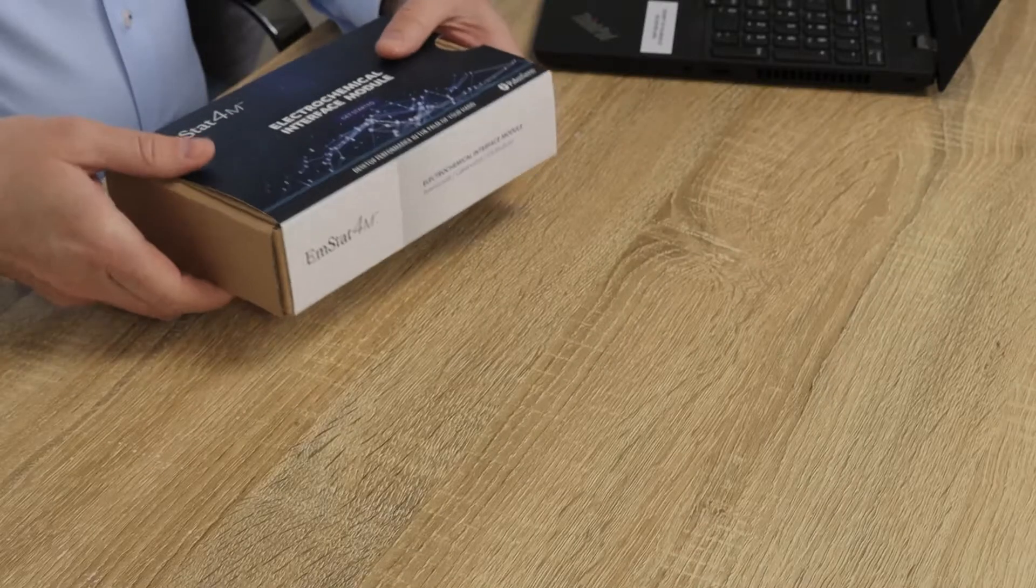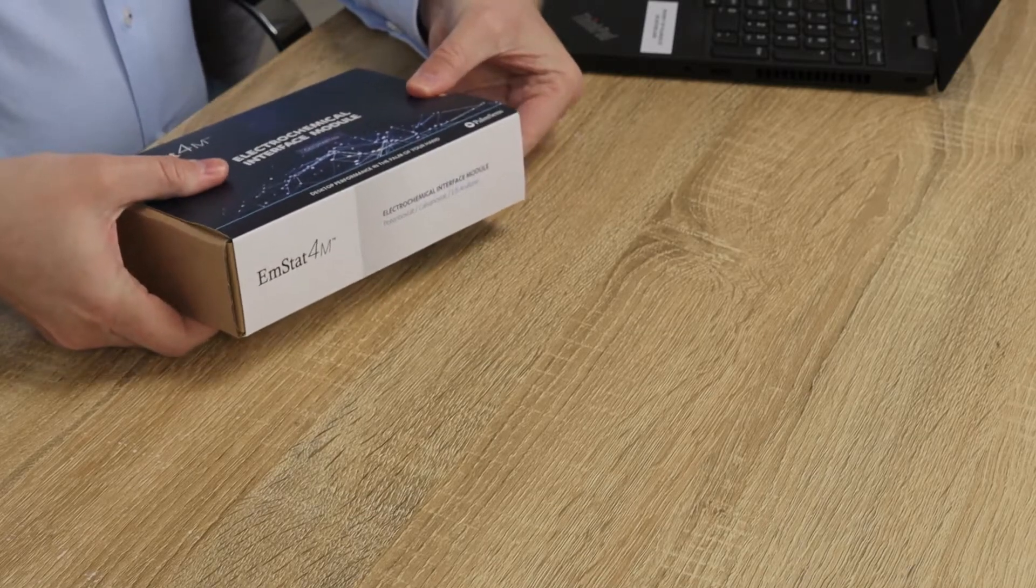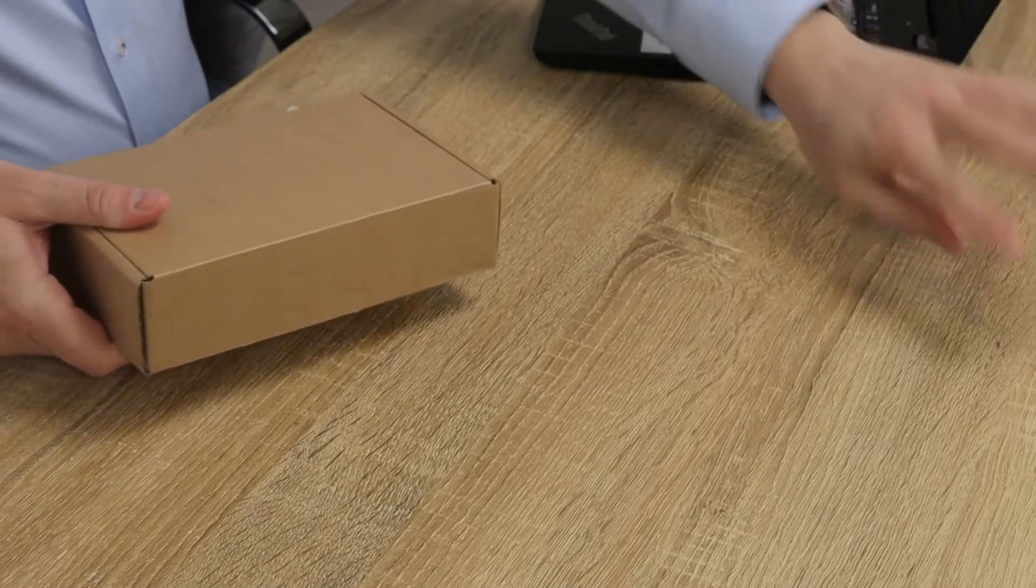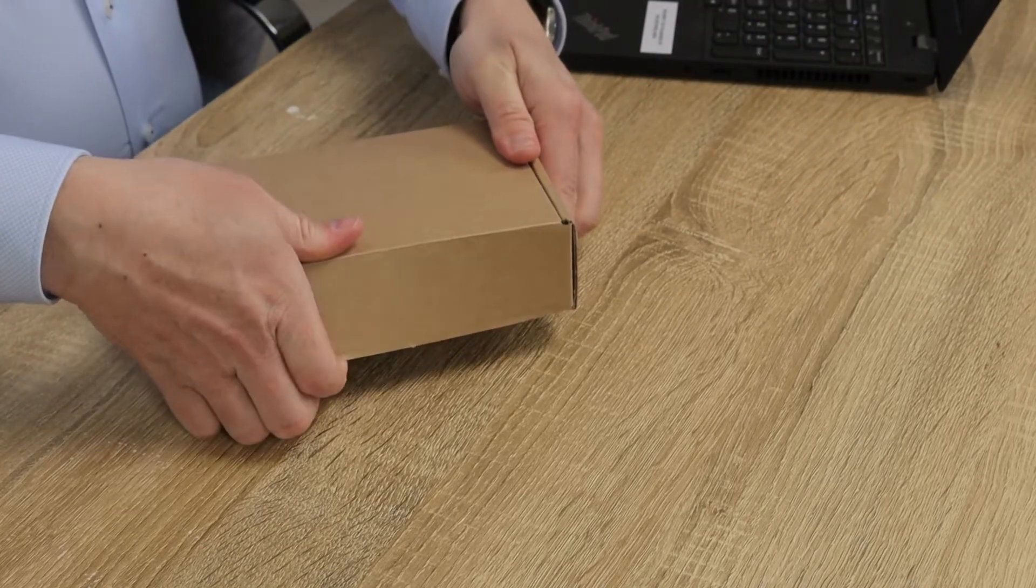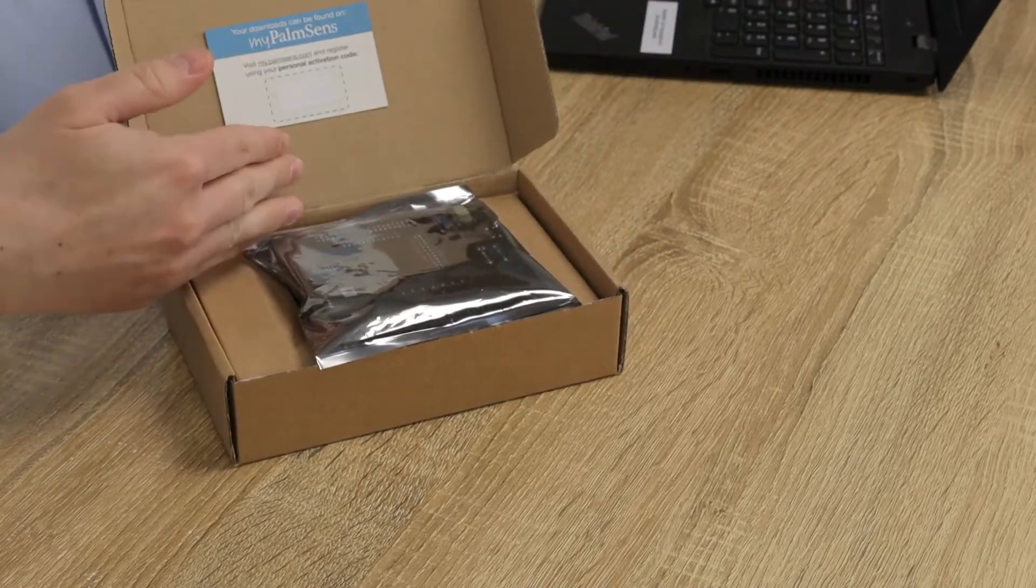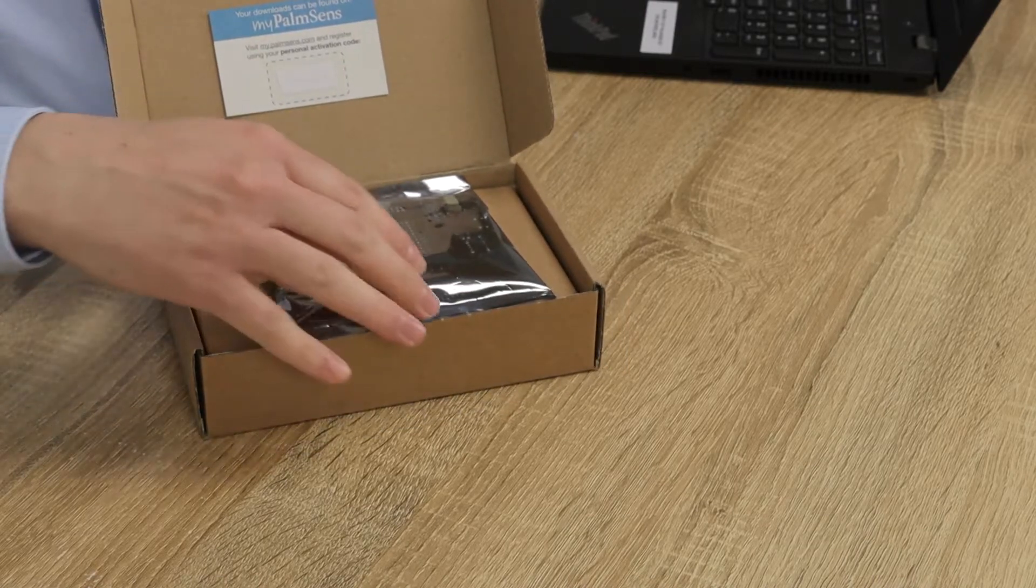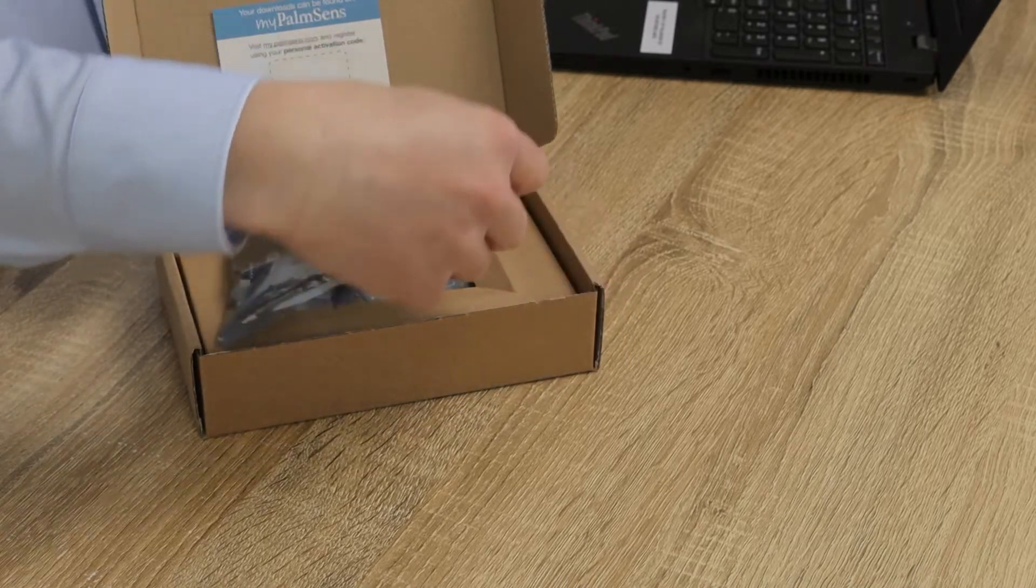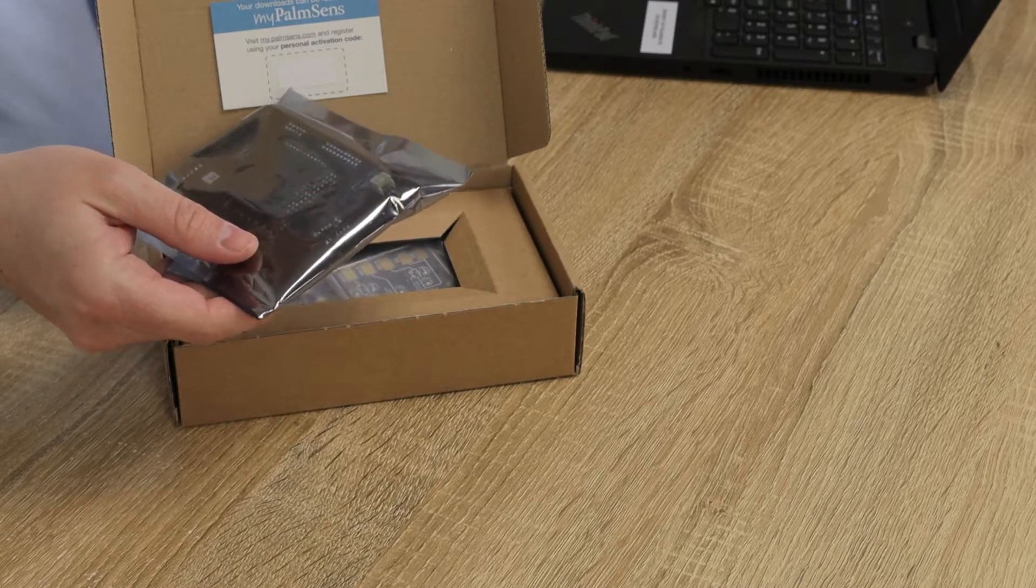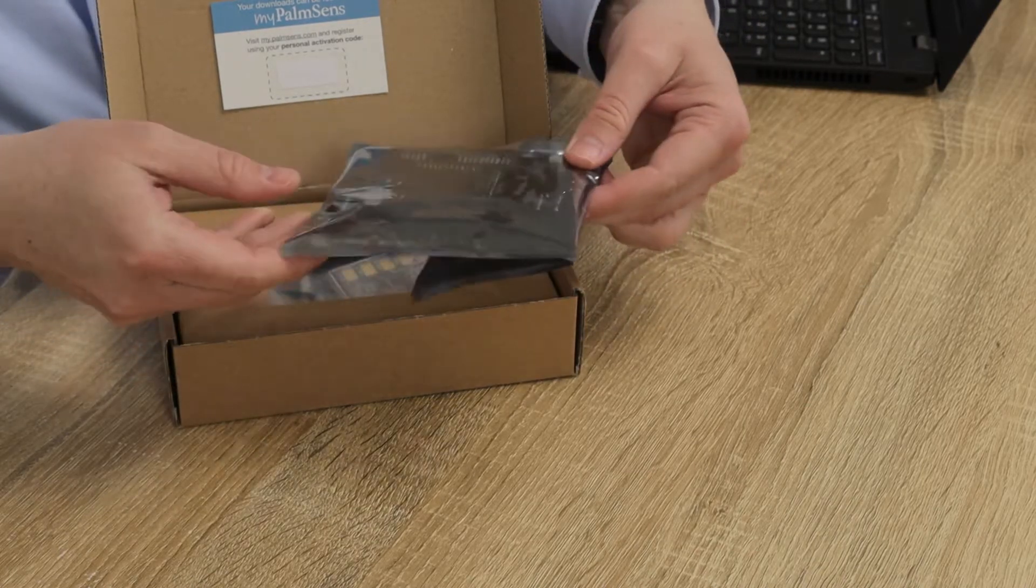Okay, so let's have a look at what's inside this box. When I open it we can already see in the top is a card with an activation code. You can use that to make an account on our website and download software and documentation in a digital form.